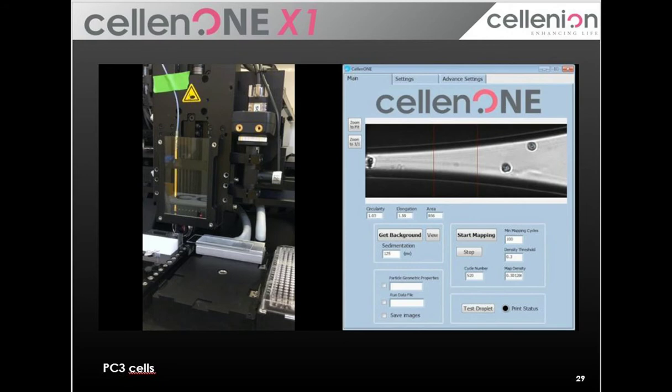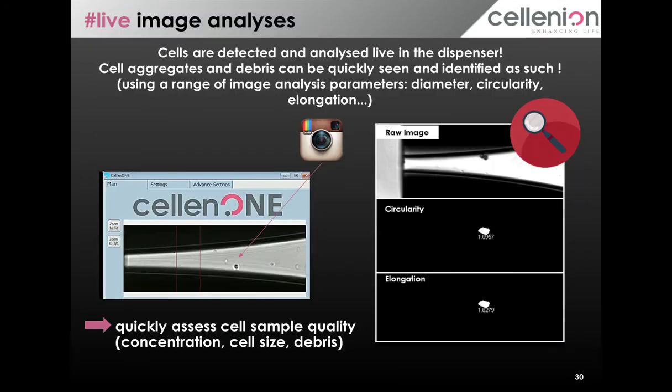So what you just saw on this video was single cells being isolated and dispensed into microwells onto a microscope slide. Out of 400 position fields, 98% of the positions, 394, contained a single cell. And this was filled in about 18 minutes.